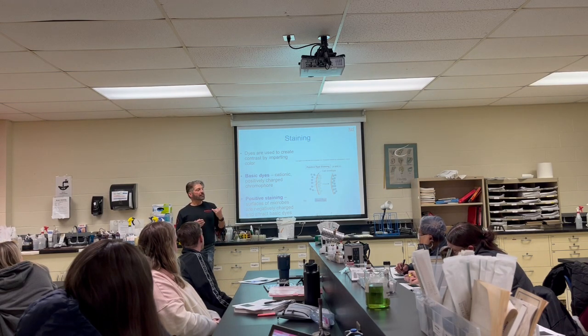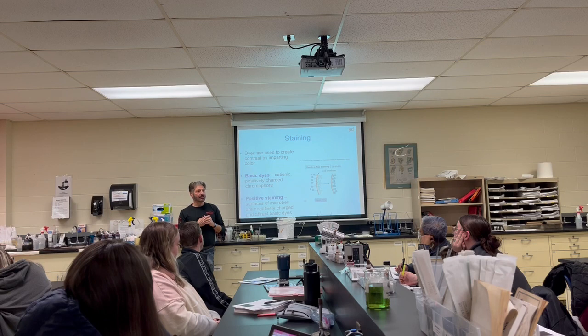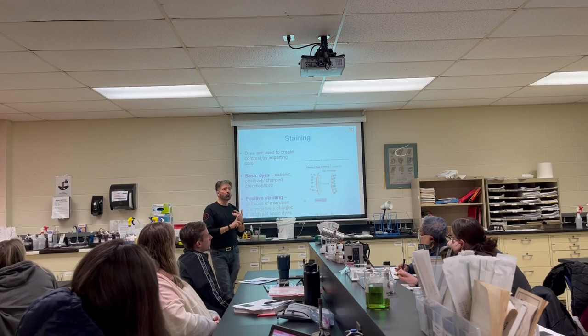So if a bacteria has a flagella, what is it able to do? Swim, move. Nice. What if it has like a capsule? What if it has a coating around it? Protect it. All right, keeps it from drying out. And if I was a really, really hungry white blood cell, a macrophage, and I wanted to consume something with a capsule on it, I would have to chew through that rubbery protein layer before I get to something. So it's very, very protective. So we're going to be doing some endospore staining, we'll do some capsule staining, and some flagella staining.